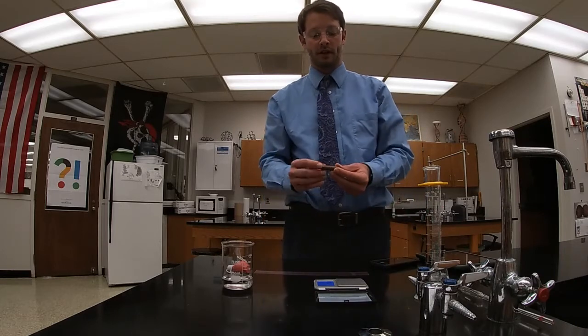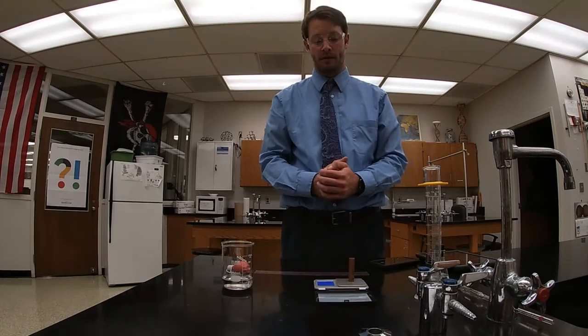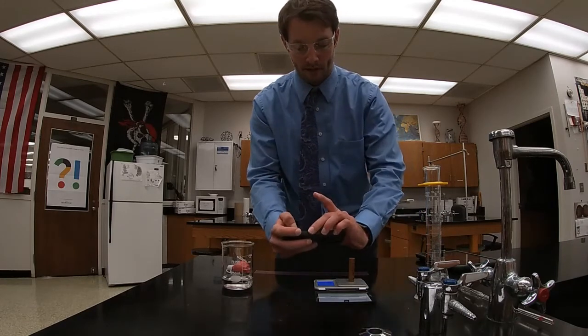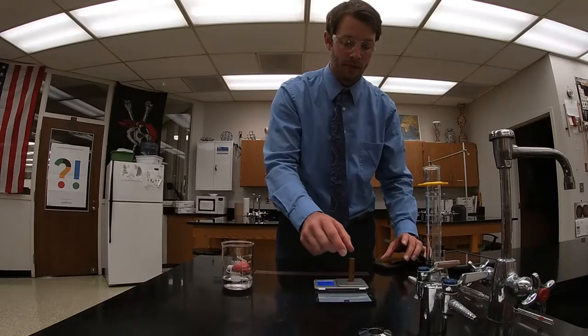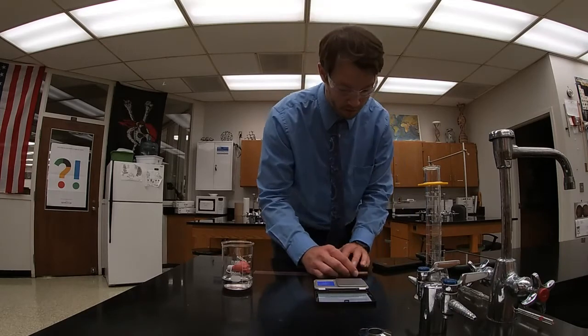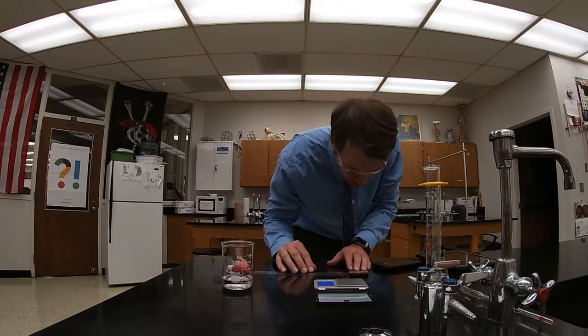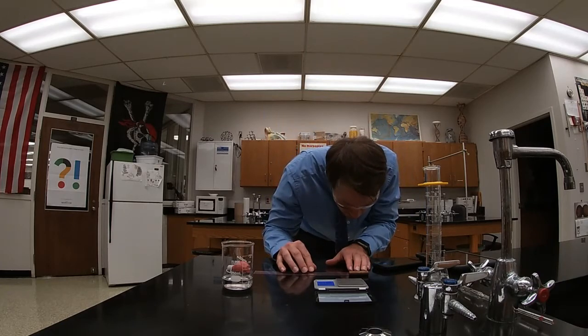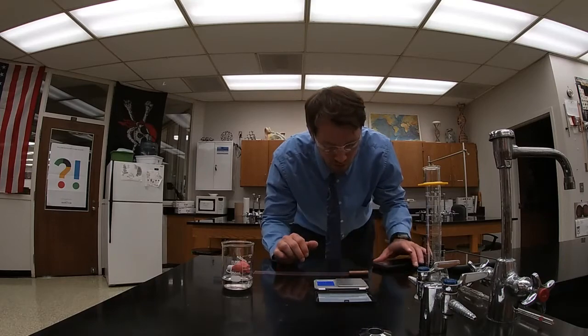We need to first take our object and get the mass of it. This is a cylinder made of copper. Record its mass. We need to then get the dimensions of the cylinder. So I'm going to first measure the height of the cylinder, being extra careful to line up the edge of the cylinder on the 0 mark of the ruler.